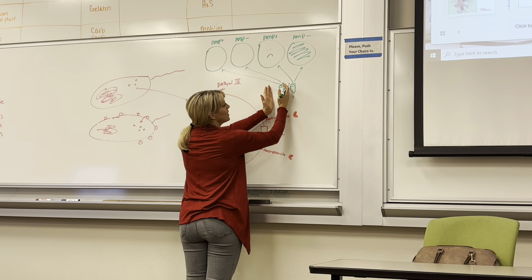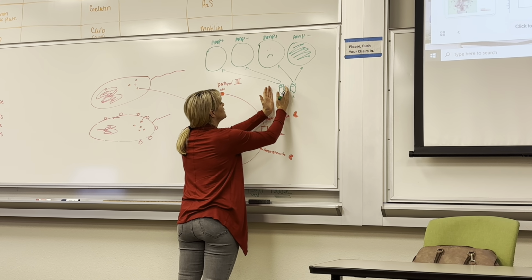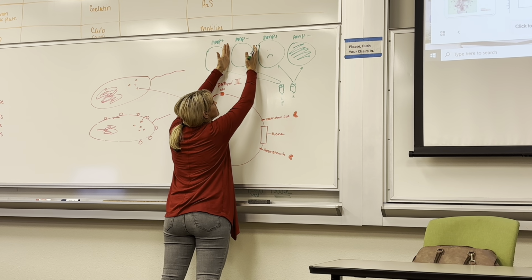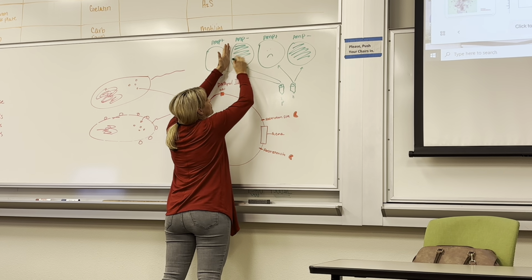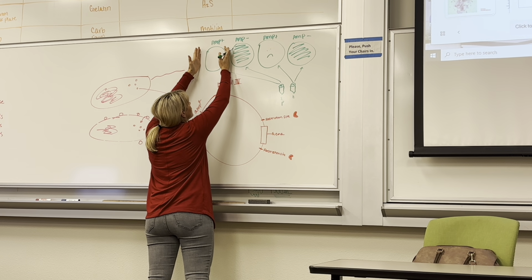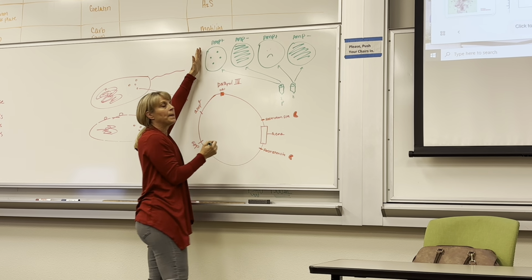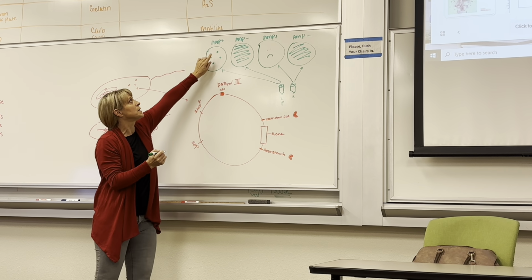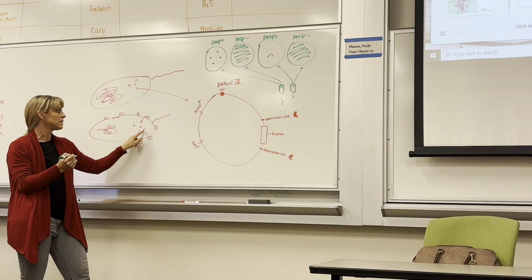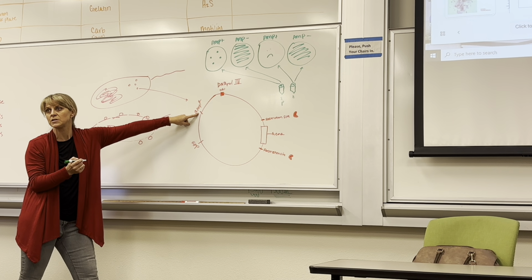Okay, so here was our E. coli with our plasmid. Would it grow without ampicillin? Yes, it'll grow everywhere. If it's E. coli with our plasmid, will it grow on ampicillin positive? Yes. Only our transformants, right? Only the ones that have the plasmid, because if this ended up inside, then now it's antibiotic resistant, because that's the antibiotic resistant gene.